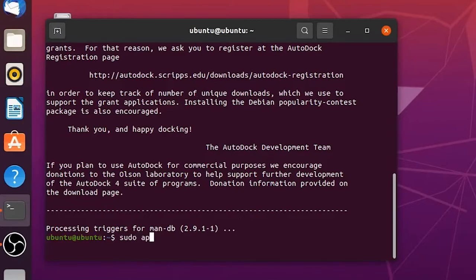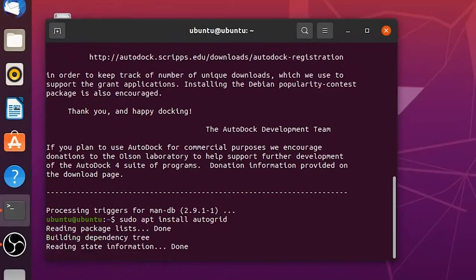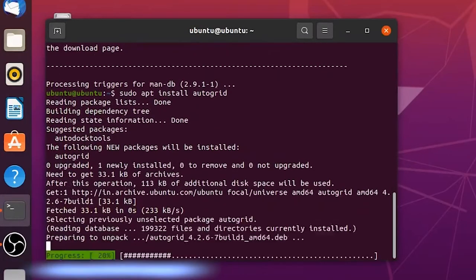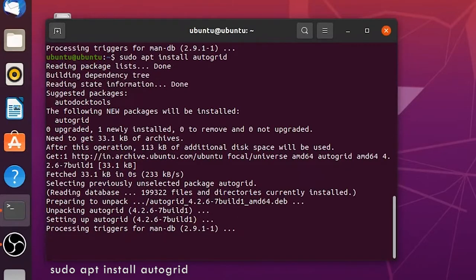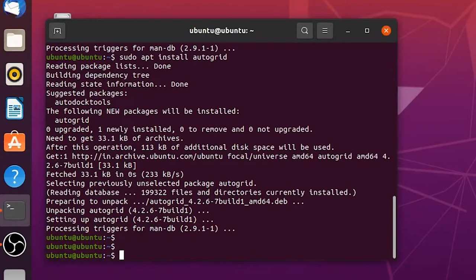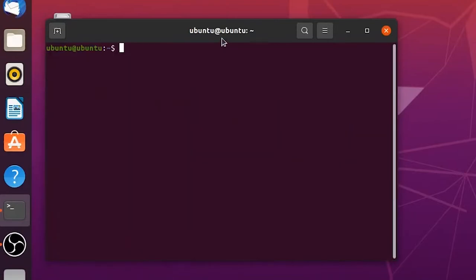Now Autodock is successfully installed. For this the system has to be connected to the internet. Next we have to install Autogrid. To install Autogrid give the command sudo apt install autogrid in the same terminal. Now we have installed Autodock and Autogrid successfully on Ubuntu.